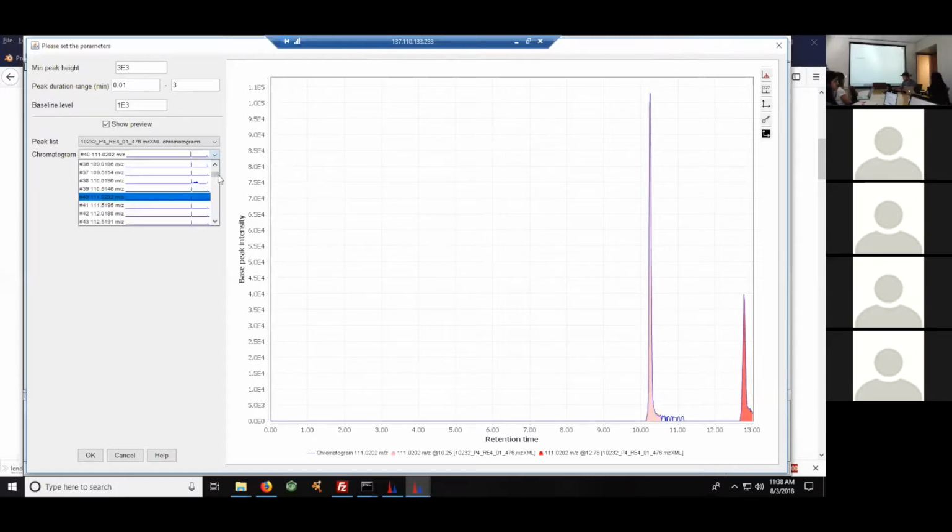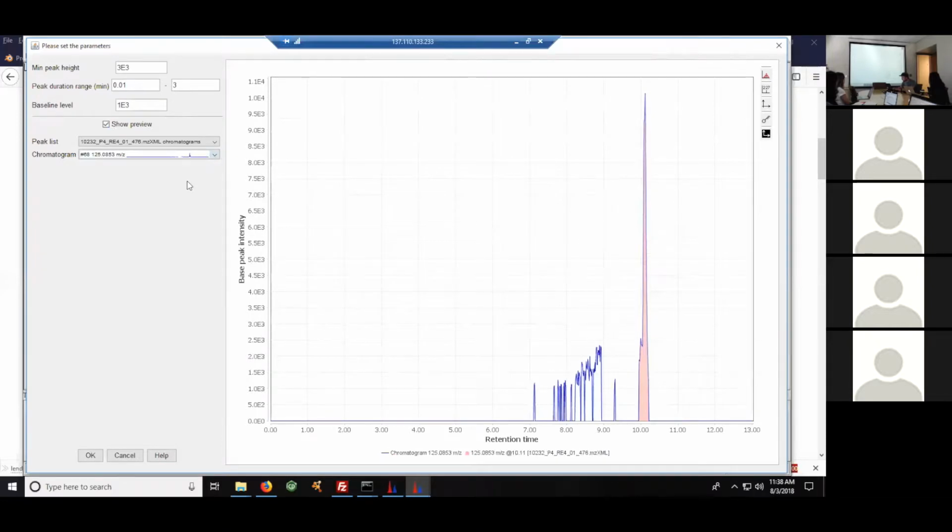And I think that's the strength of the local minimum search. It does simple things very well. When it gets more complicated, it might not be super awesome. So here, okay, the main peak is considered, but the other peak not, probably because it's under our initial threshold.